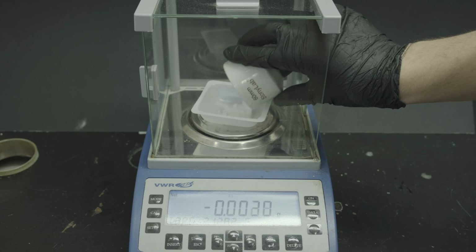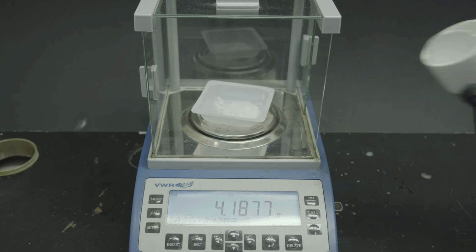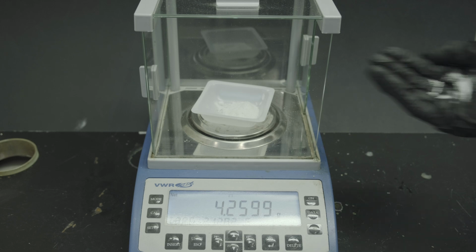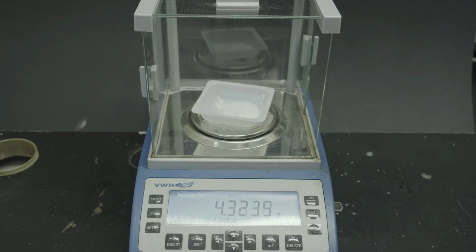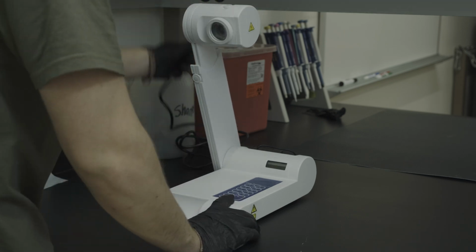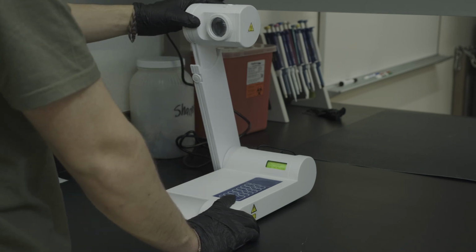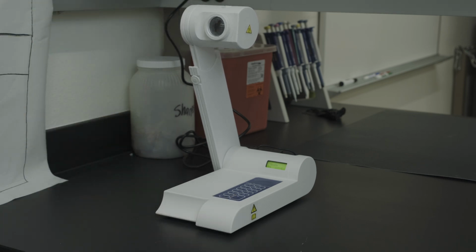I dumped it all out onto the scale, and as you could see, I got a pretty decent yield of over 4 grams, starting off with 6. But I had to actually make sure that this really was aspirin and not something else. What I have here is a really fancy melting point apparatus that is pretty much going to be able to tell me if this is aspirin based on when my sample melts.